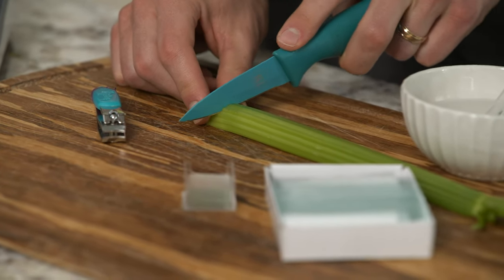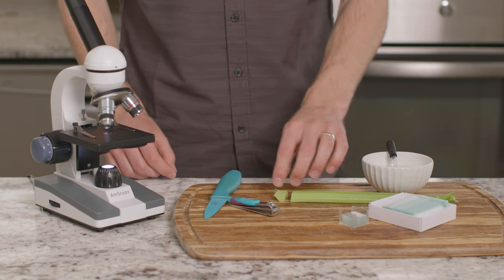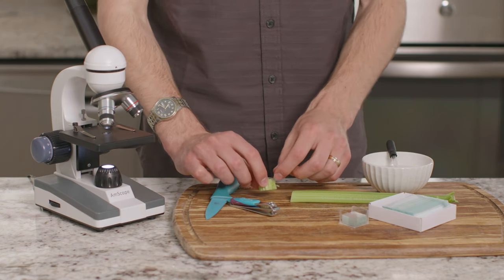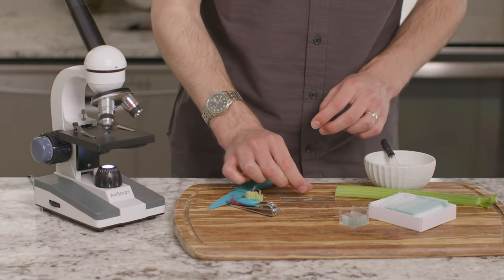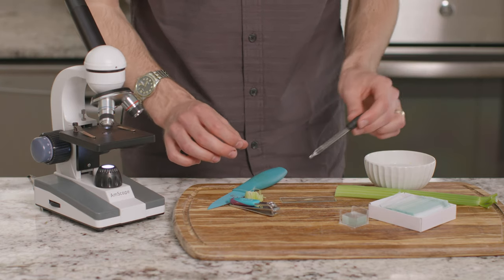First, let's cut a half inch piece of celery, then find the end of one of the fibers that runs through the celery, and pull it out. Let's put this celery fiber on a microscope slide, along with a drop of distilled water, and cover it with a slide cover.